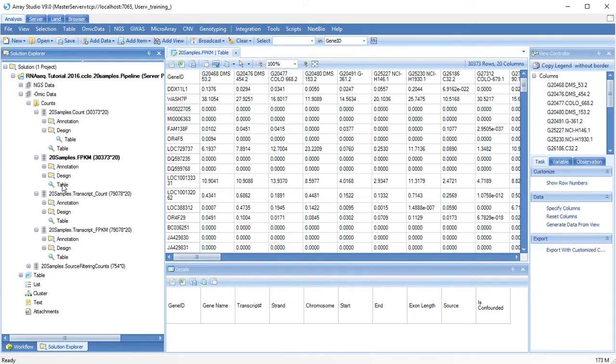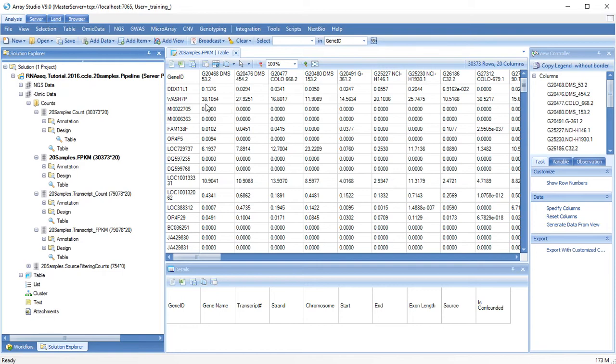We will first normalize these data so that the upper quartile is scaled to an FPKM value of 10, and then we will log2 transform the data to better approximate a normal distribution.